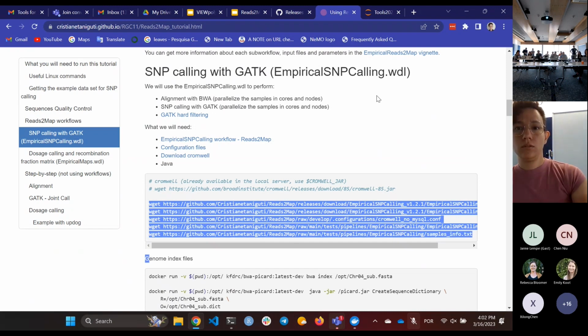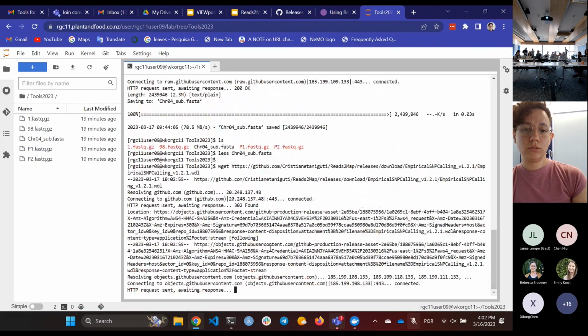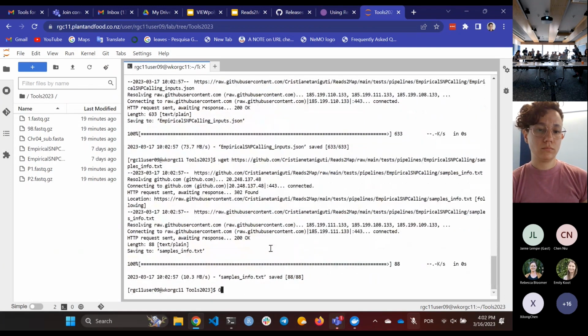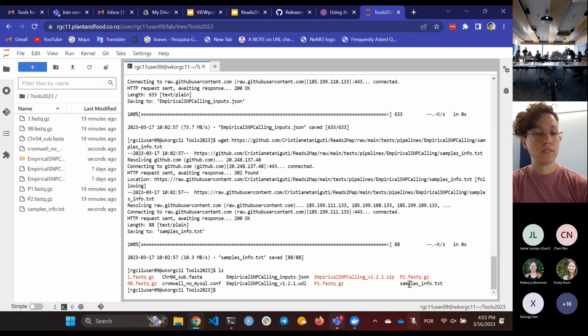Okay. You come here. And you should have here now the empirical SNP calling imputes WDL, the zip file, and also this sample info.